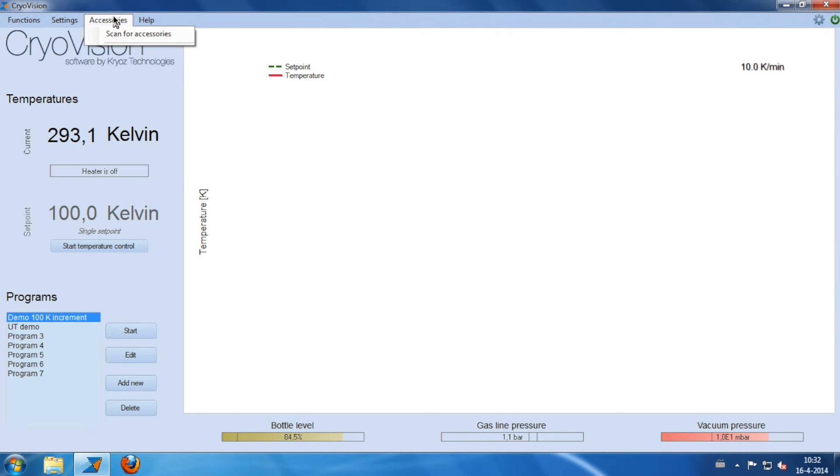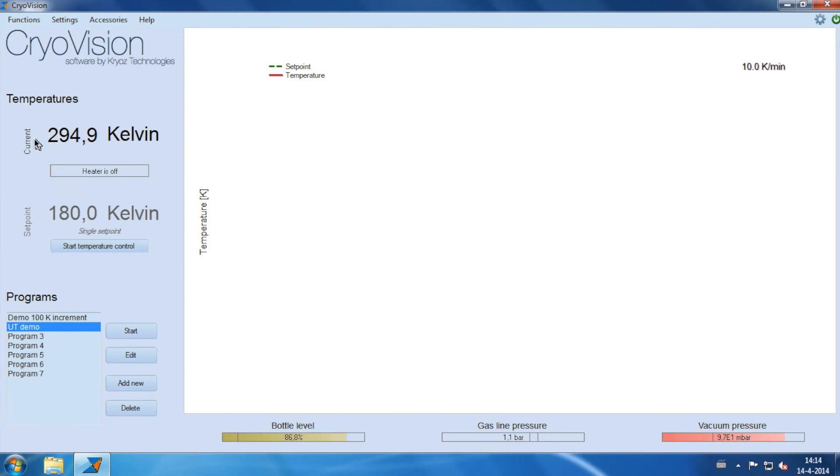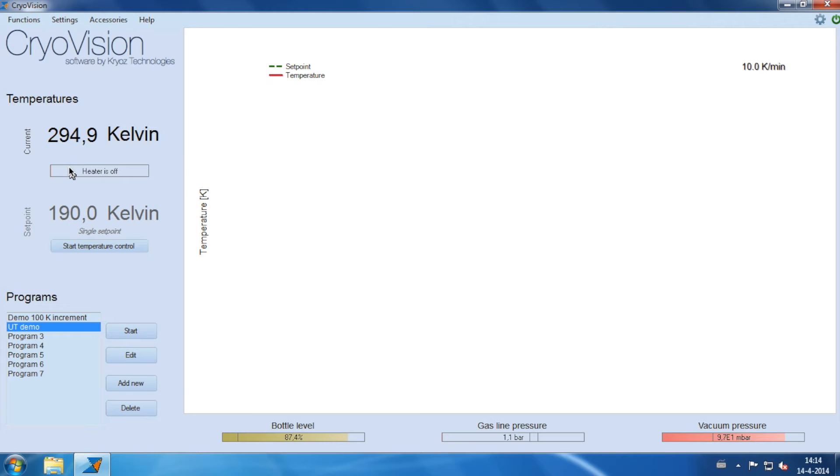The accessories menu will show any additional hardware when connected. In this area, the current and setpoint temperatures are shown. Also, the amount of power required to control the temperature at the given setpoint is displayed.